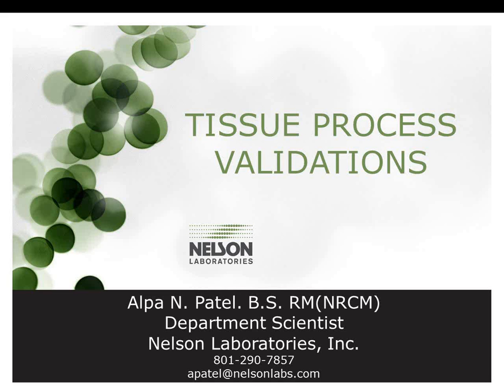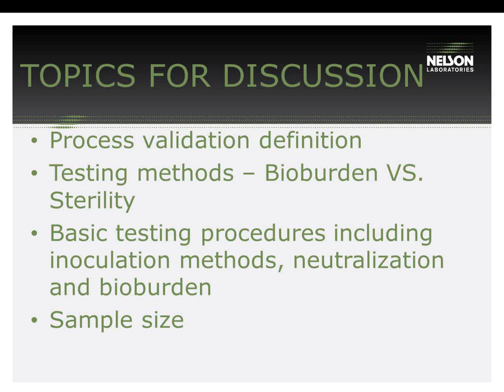Thank you, Martel. For the second part of the webinar, we will focus on the specifications of tissue testing and the steps that are taken to perform this validation. In this part of the presentation, I will go over the process validation testing and how it is performed through the eyes of the laboratory. I will go over specific testing details of the bioburden and sterility testing and the differences in the testing composition and the steps needed to accomplish the validation, including sample size and type.